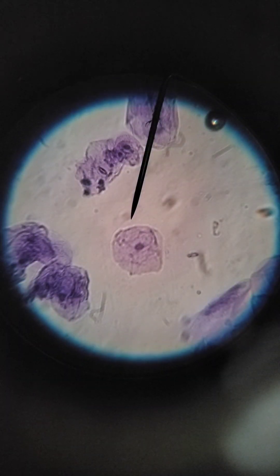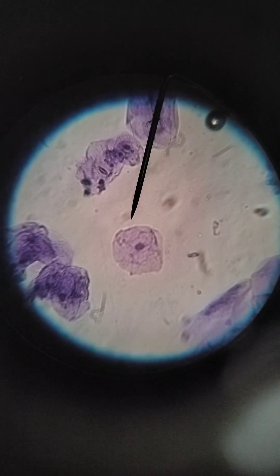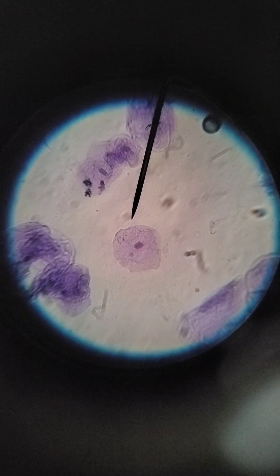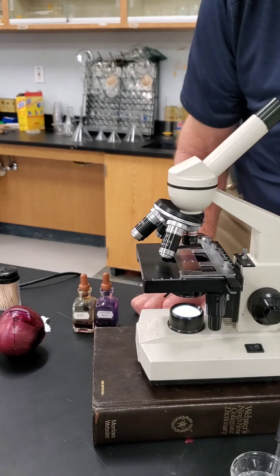We looked around a little bit more and we found one cell all by itself. This is high power. How big is the cell?